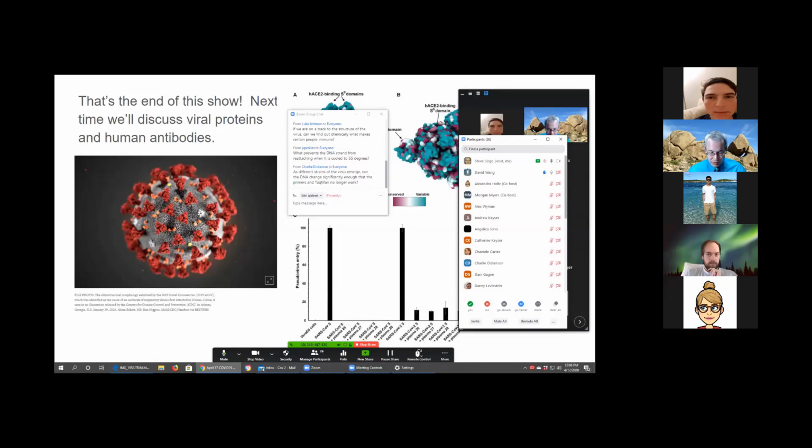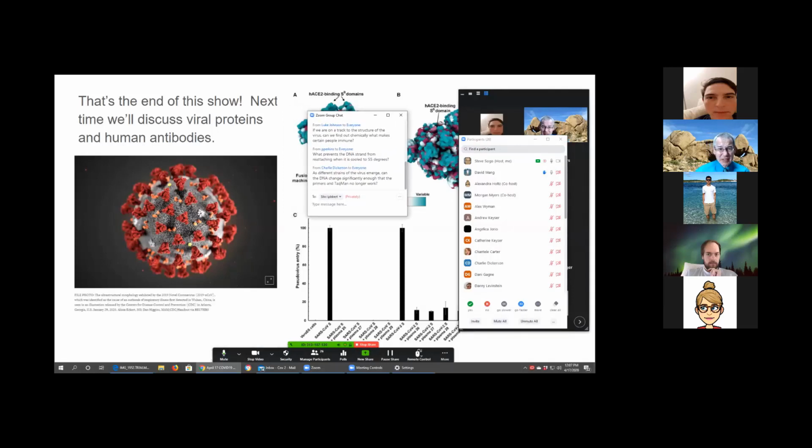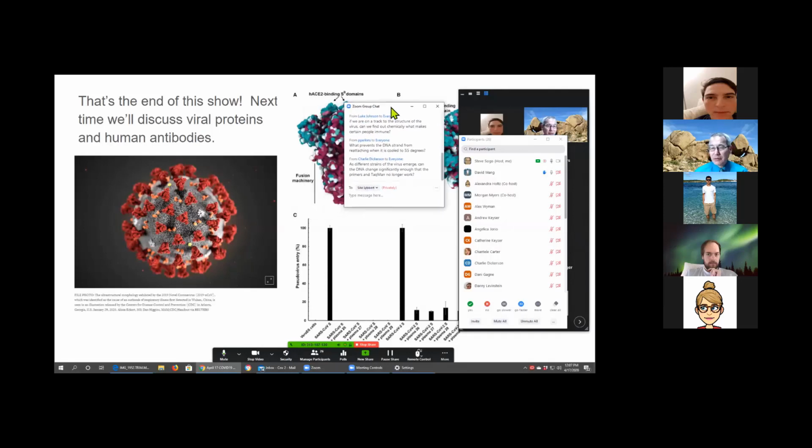For me, the more important thing is just to get more tests done, and with high throughput PCR, those machines are well established. It's not like we have to invent a new technology. People have been doing PCR for 20 years with great success. Thank you, David. I'm glad to see that you're also following up on interesting things.